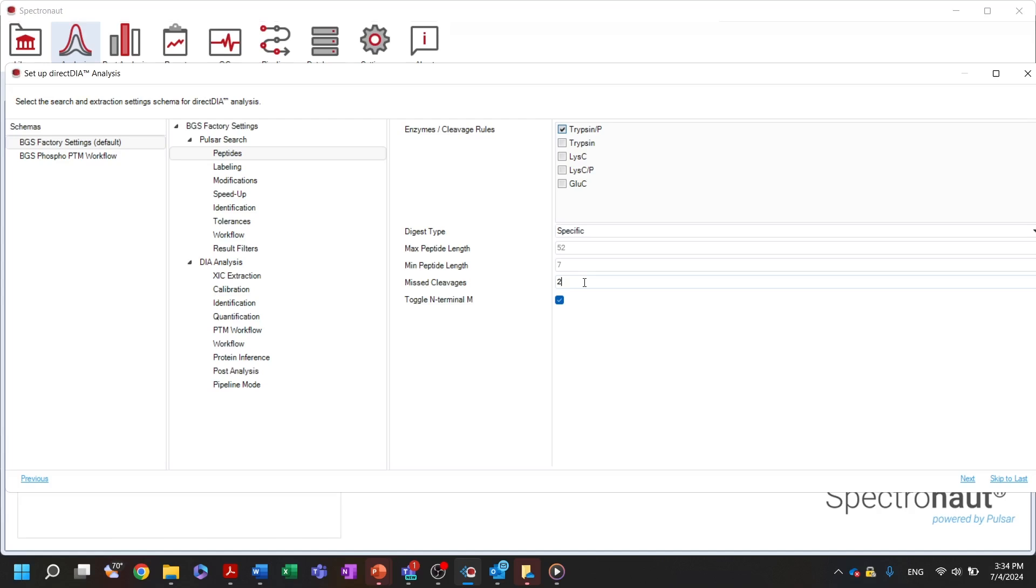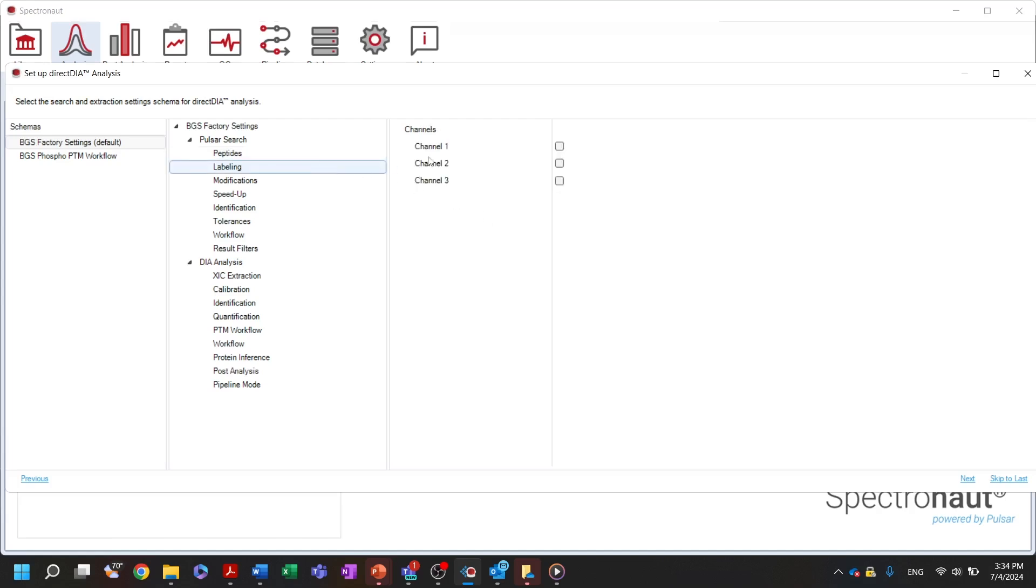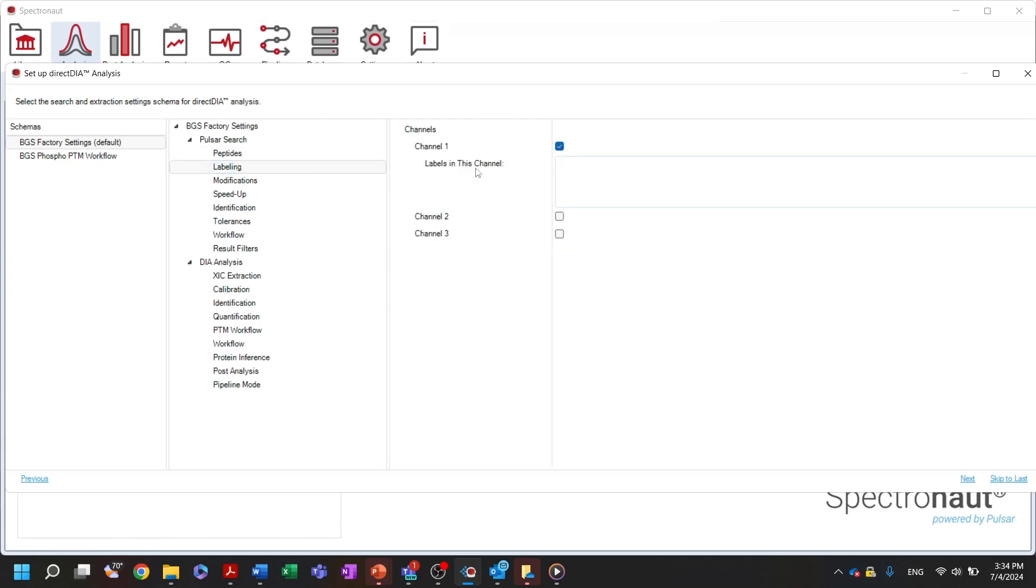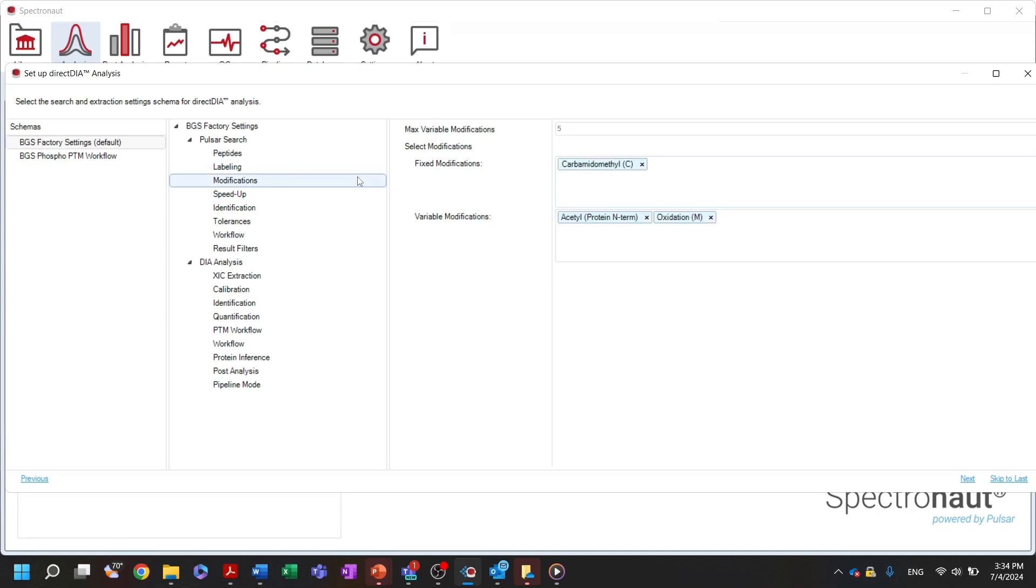In the labeling node, you can specify any peptide labels used in your experiment. And in the modification node, you can add any additional fix or variable modifications you would like to include in your search.